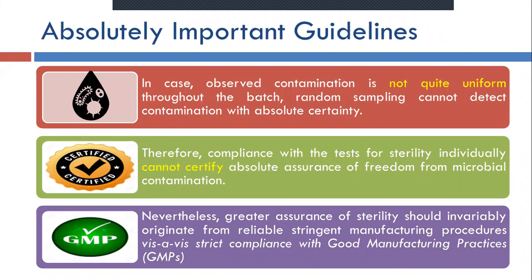Therefore, compliance with the test for sterility individually cannot certify absolute assurance of freedom from microbial contamination. What is the meaning of this? Sterility testing alone does not give you the guarantee that your product is sterile. You manufacture the product, subject it to sterilization, and then test it for sterility.